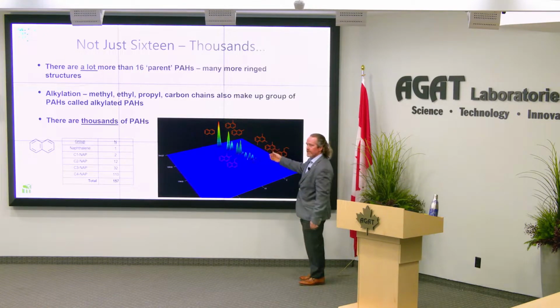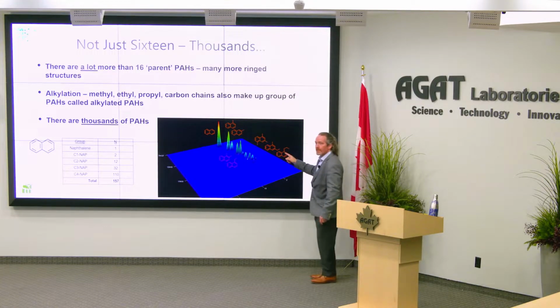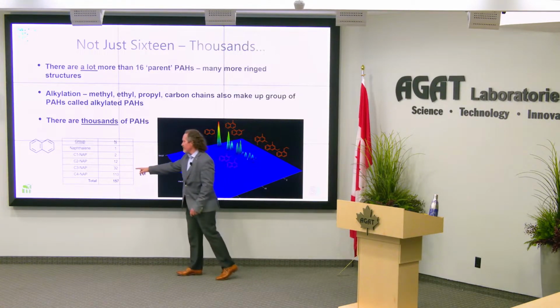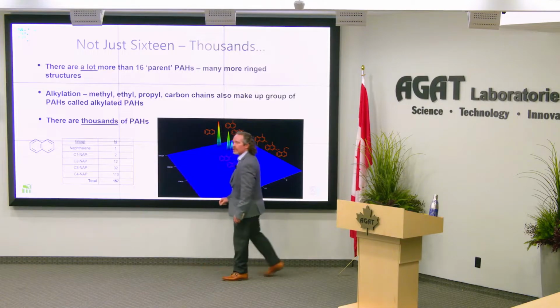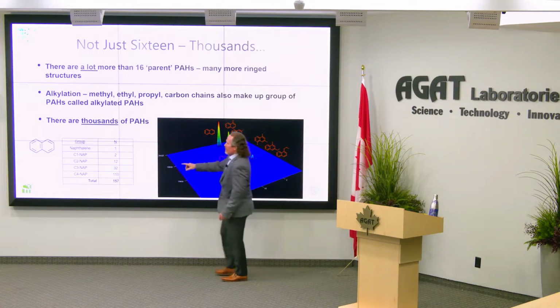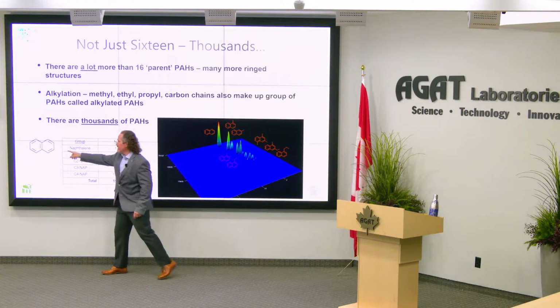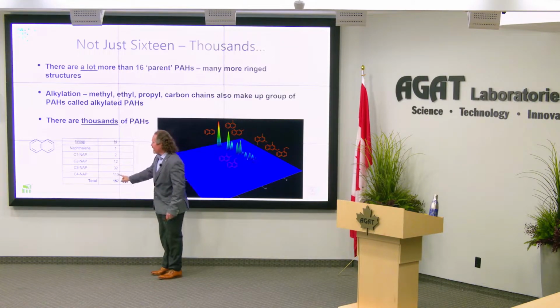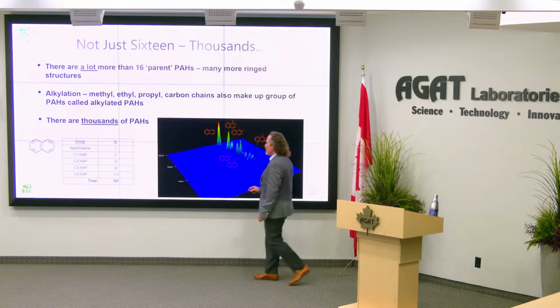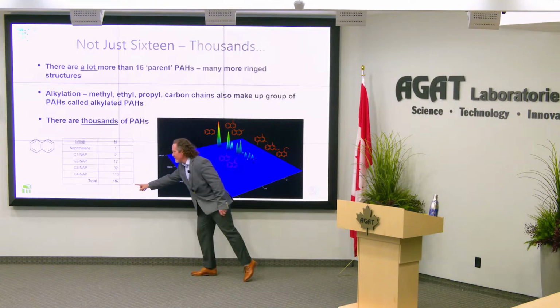C3 naphthalenes, guess what? Gets more complex. We can have a methyl, we can have an ethyl, or we can have a propyl. And all of those could be made. So there's actually, and someone's already done the math, there's a publication I'll show in just a second, there's 32 different congeners of the C3 naphthalene. So naphthalene, the one compound we measure that has 2 benzene rings together, if you take its family, there's actually 157 different congeners present, okay? So we're usually representing naphthalene with 1 measurement when there's actually 157 different ones.